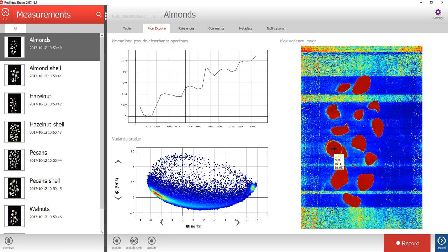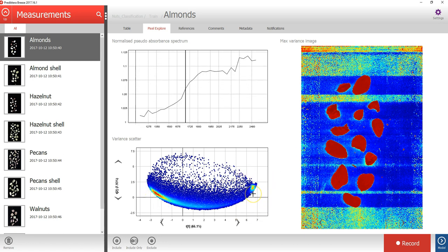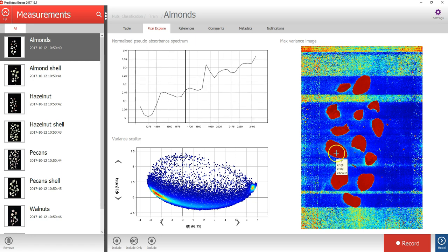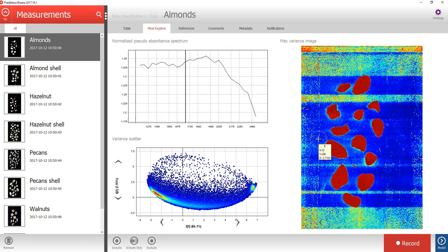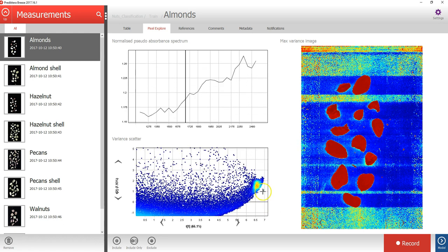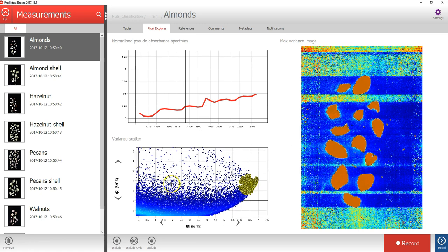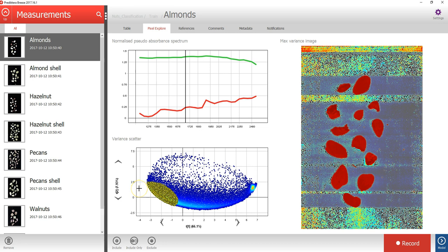The max variance image is colored by the variation in the first component of the PCA model, which corresponds to the x-axis in the scatterplot. This visualizes the biggest spectral variation in the image — in this case, the difference between the samples in red and the background in blue. By selecting a cluster of points in the scatterplot, you can see where these pixels are located in the image, and also see the average spectra for that selection.